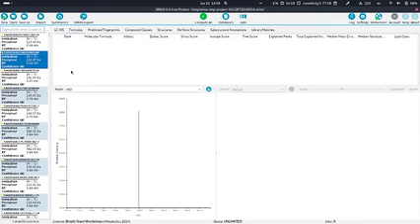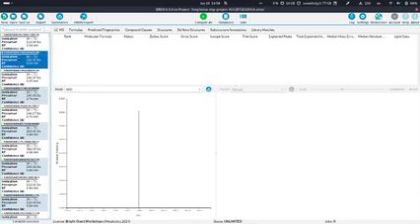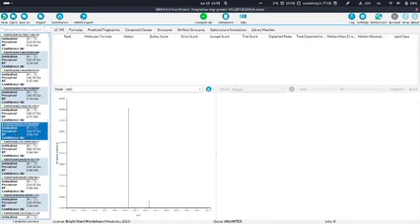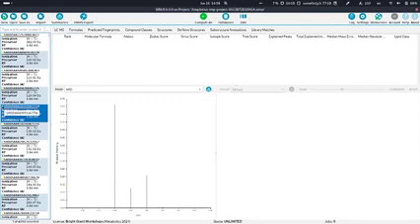And now I will just explain a few things before we have computed anything. What you can see already, and this is also new, is that next to the left of the compound name, or the feature name, you have now a small dot, a small circle, which here is mostly yellow, but there are also some dots which are green. I think if you don't have it on your laptop, it's a little bit hard to see on the small screen, but I can show you directly what this corresponds to.